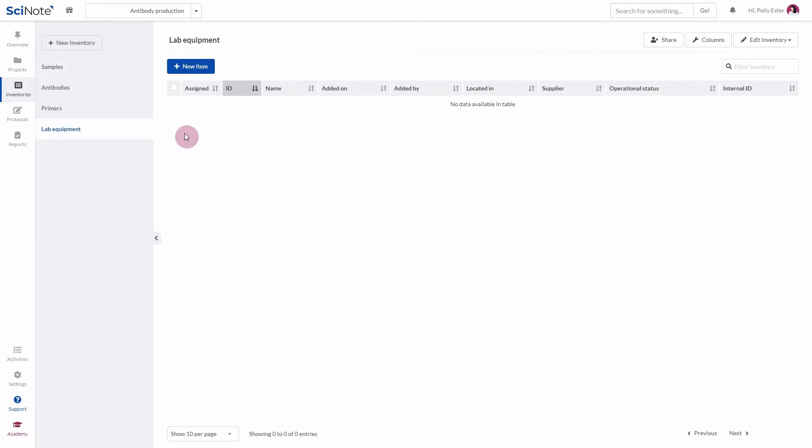In the Inventories screen, first make sure you have created at least as many columns in SciNote as you have in your Excel file you wish to import your items from.